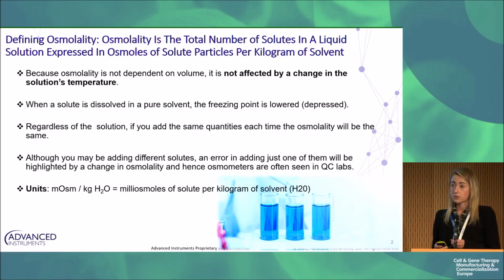And this is why osmometers are most commonly seen within quality control laboratories. Again, something to note is that osmolality cannot characterize your solution. It cannot tell you what is in the solution. It can just tell you the concentration of those solutes in solution.